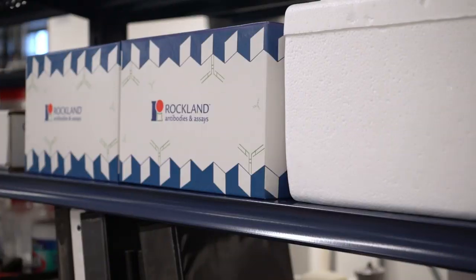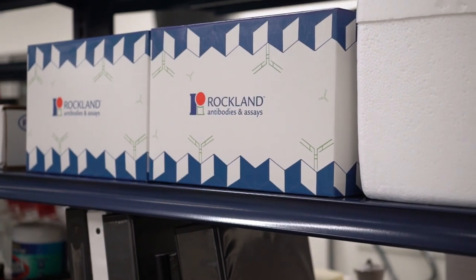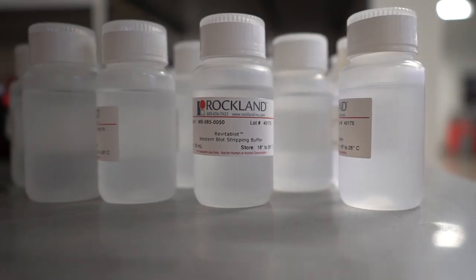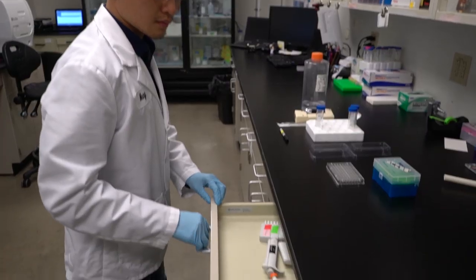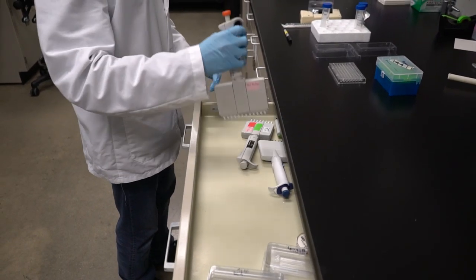Here at Rockland we develop antibodies, immunoassays and research tools to support scientists around the globe. We offer our expertise to solve problems in life sciences and we are committed to advance the life sciences to foster a better world.